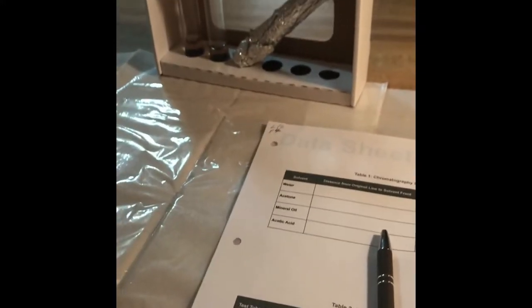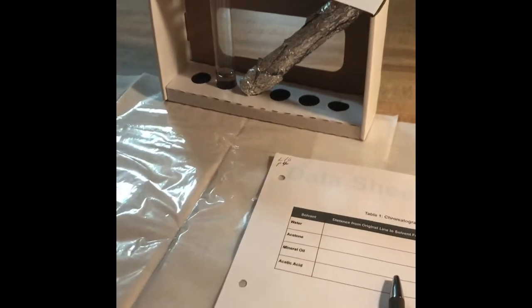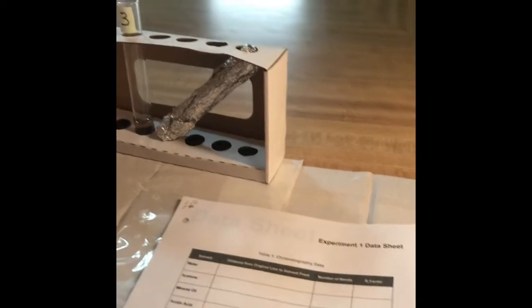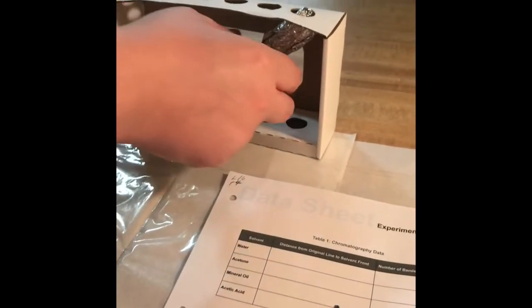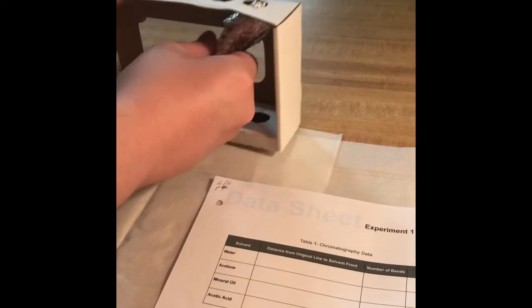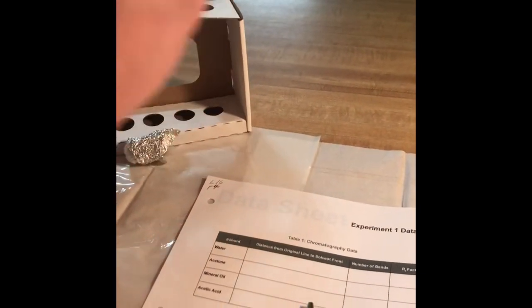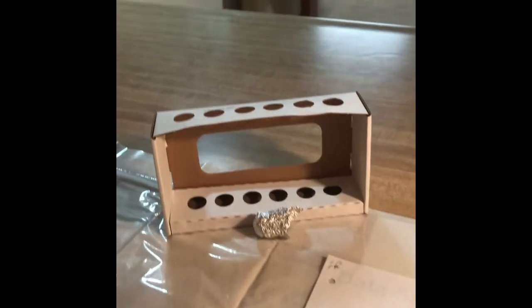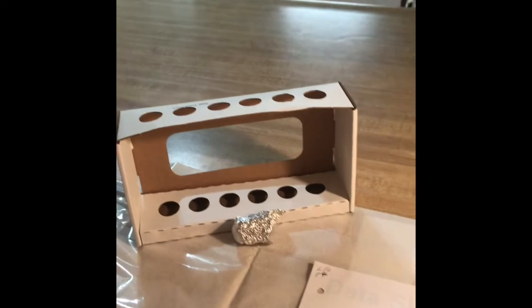Okay, it has been 7 hours and the solutions in test tubes 1 and 3 are now clear. I am now uncovering test tube 2 and making a notation on Table 2 that the color in the test tube is still purple.